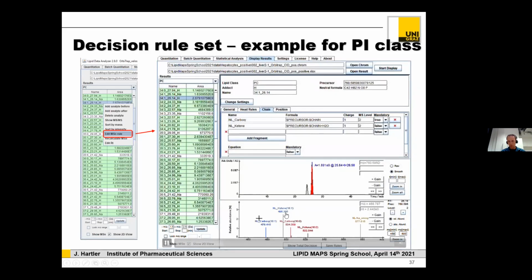You can see now here I show with the crosshair cursor. This one is, and now I remove it. You see it's gone. And now I enter again the 2, and they pop up again. So you can easily try to develop your own.